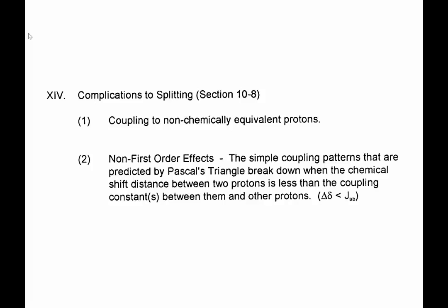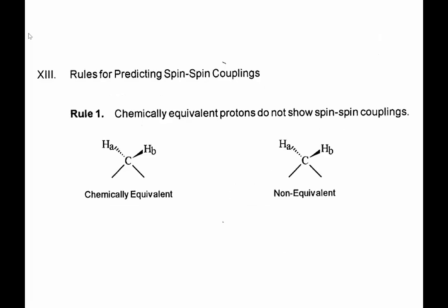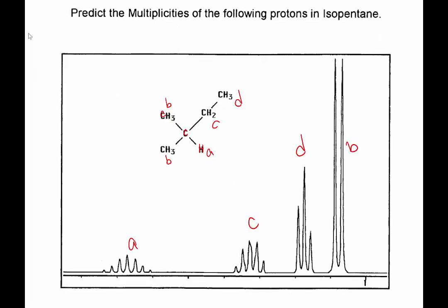Okay, so for the last segment, where we'll end off today, we saw in that last spectrum that we can determine the structure with the coupling.